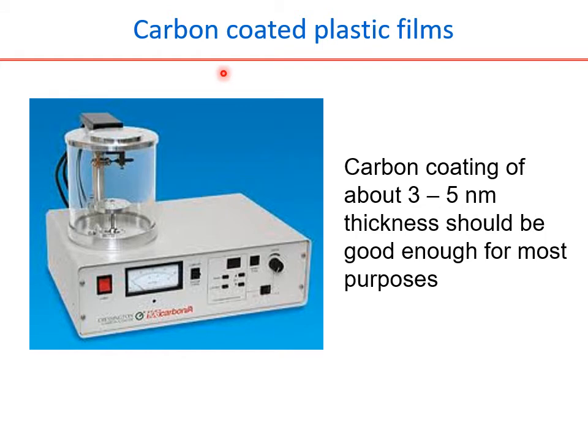Now we'll discuss the carbon coated on the plastic films. So the first question comes, why do we have to use carbon coated on plastic films? As you know, the plastic film has the least adsorption. Adsorption is a phenomenon related to the stickiness of the protein.